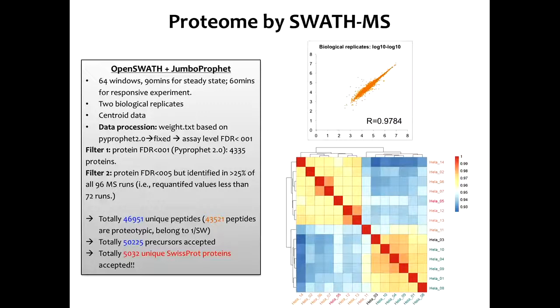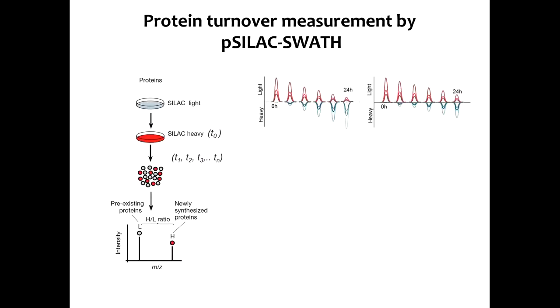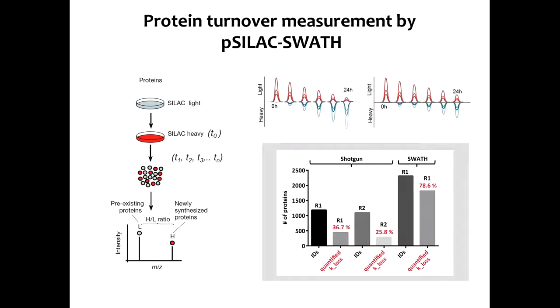We have copy number data, we have transcript data. This is proteomic data of fairly high quality. And then Yansheng also measured, using a pulsed SILAC experiment, the degradation rate of these proteins. So basically, how long do they live? We can do this by stable isotope labeling at a certain pulse, and ask how long it takes until the old protein is decaying and the new protein is coming up. From that, with some formalism, you can calculate the decay rate of the proteins.